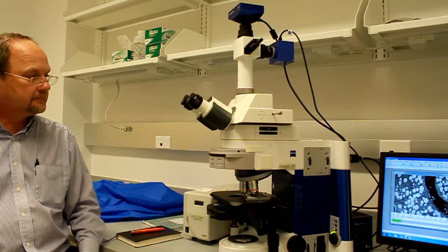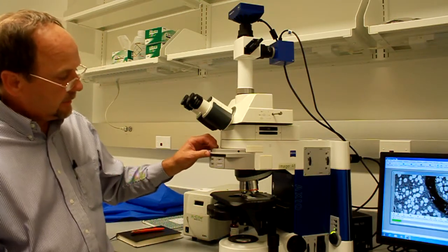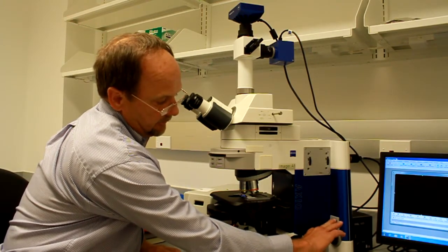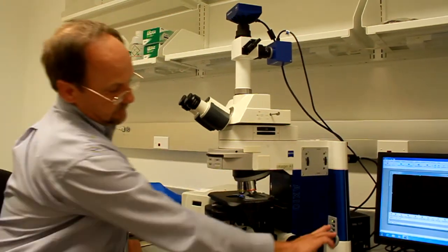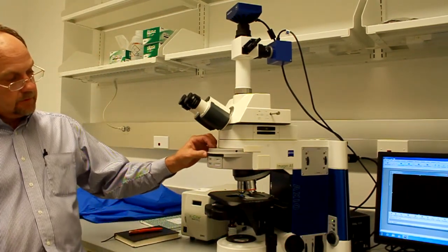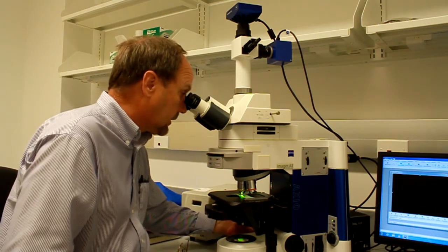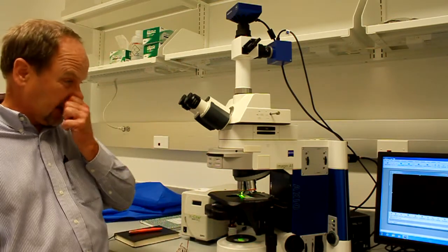Back to fluorescence. So light comes through here, and now we're going to switch it. I'm going to turn off the transmitted light and turn on the reflected light, RL. So now there's a shutter in here, and it's open now. So that's what that does. And so this is DAPI, GFP, Texas Red, and there we go. So now you're in Texas Red.